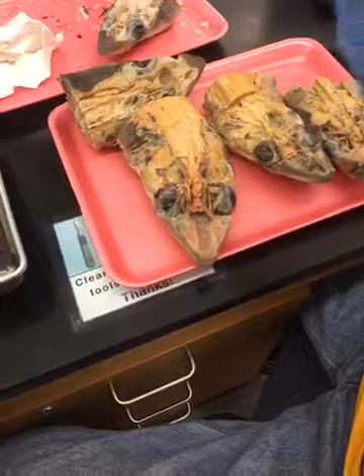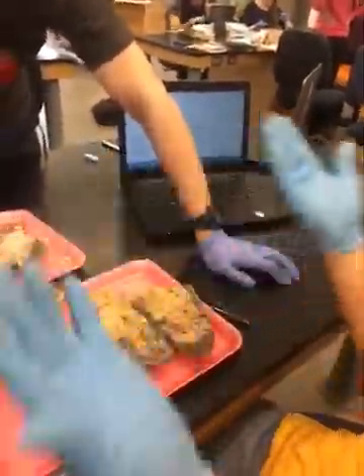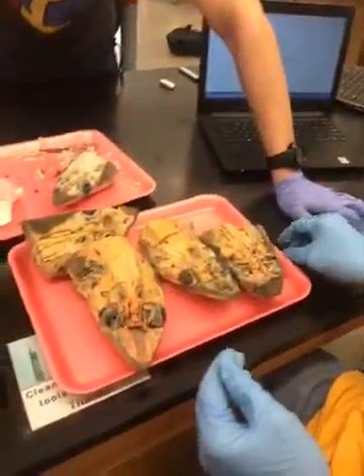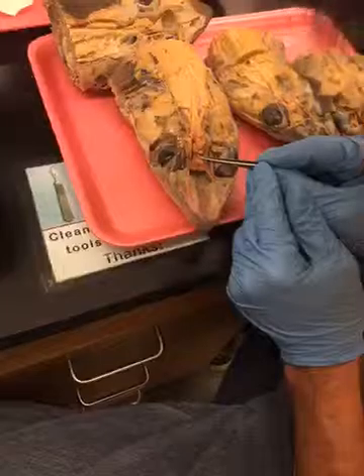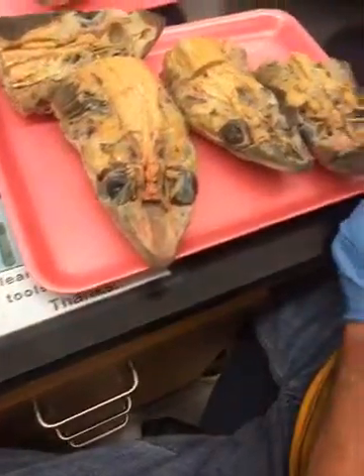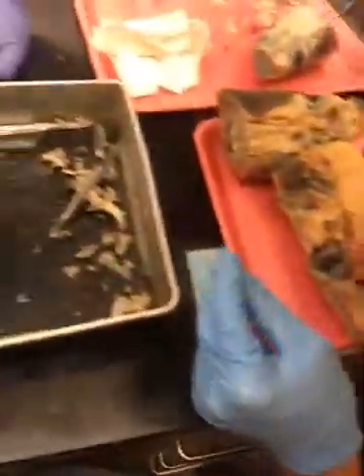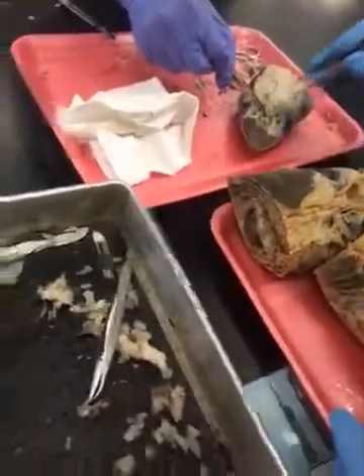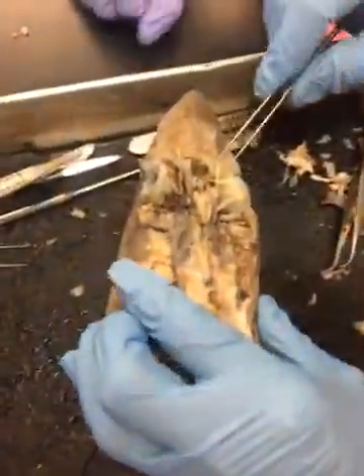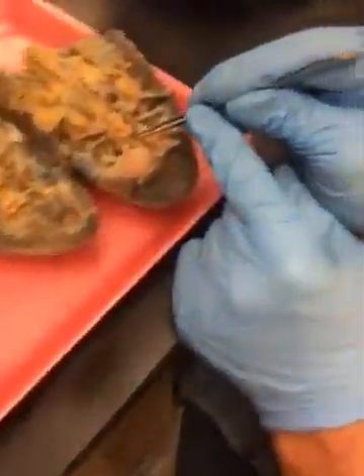When you think diencephalon, think of the thalamus along with an epi and a hypo, because that's what epi and hypo means. Okay? Now, as it turns out, the tissue that makes up the epithalamus, this thin tissue here. See the thin tissue there? On your brain, the thin tissue is sort of there, but it's really nice on this one. See that nice, thin, transparent tissue?